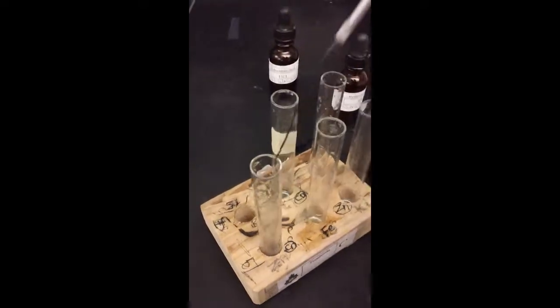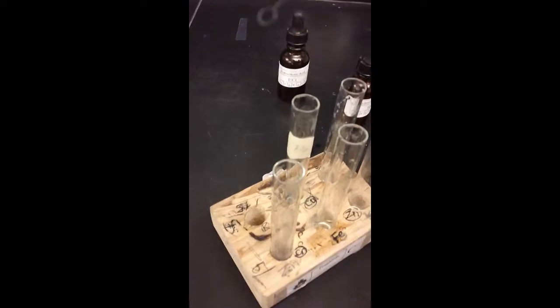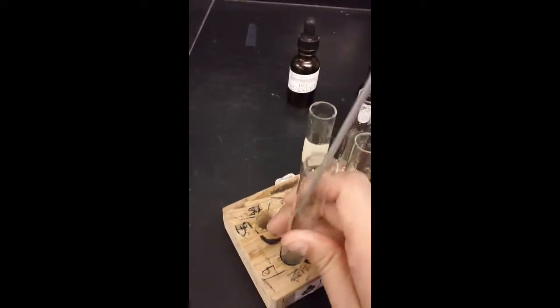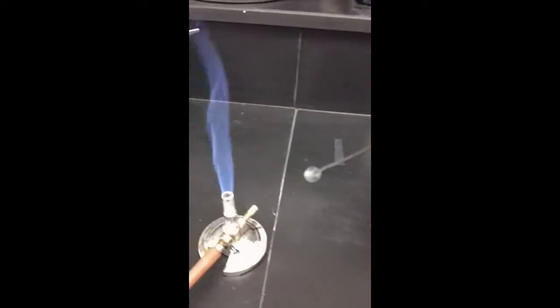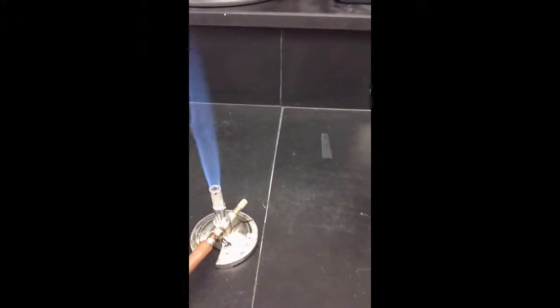Get a good little bubble. Having a hard time getting some on there. Make sure it's down there. There we go. Got a good liquid-filled bubble. Come over here, whoop, lost my bubble. So you got to keep doing it till you have a bubble in that loop.